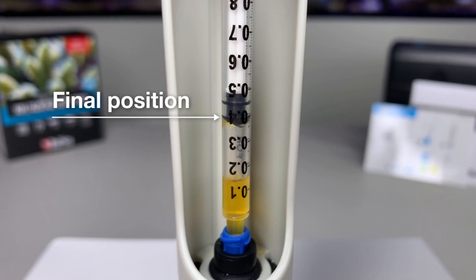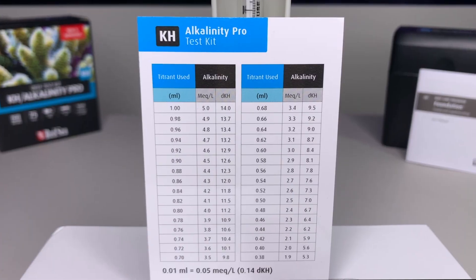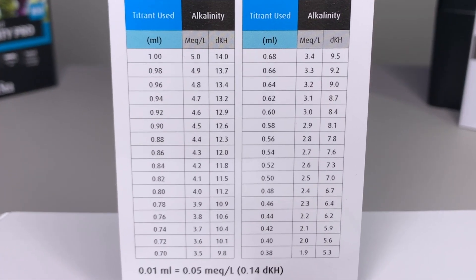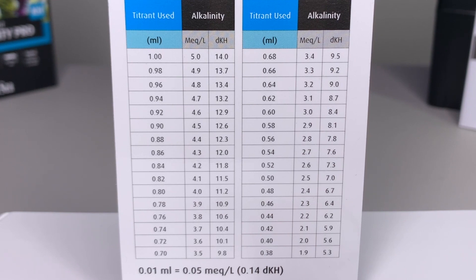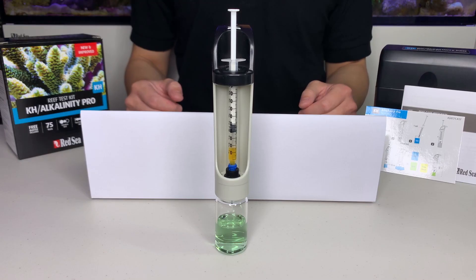Now let's take the reading. When we look at the syringe, we can see that we have used 0.61 ml of the titrant. Now we look on the card. On the back of the card there is a table, and we look for 0.61. There isn't 0.61, but there is 0.6 and 0.62. The midpoint between them gives us a reading of 8.55 dKH.